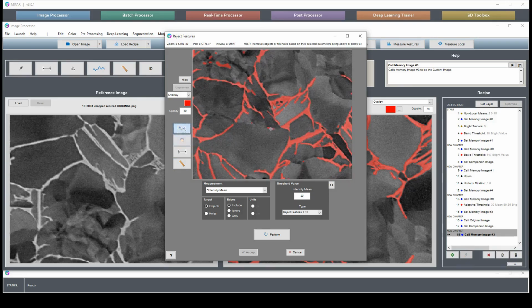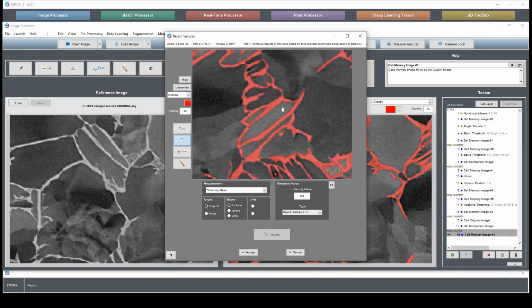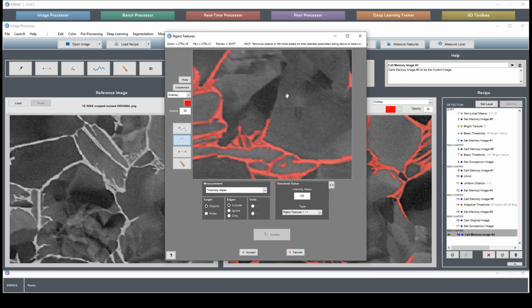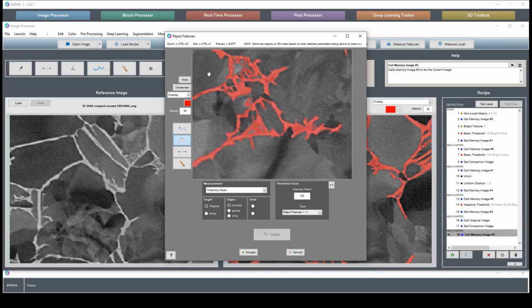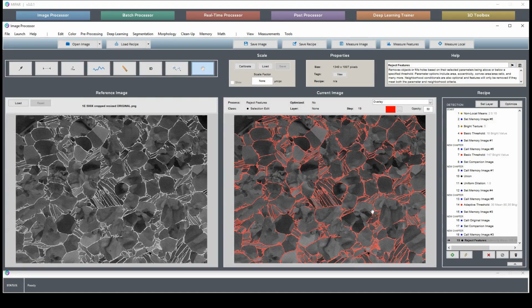How about we find some more isolated small pieces? 125, 93, so 125. So it appears that there's no hope for this dim feature here, but so be it. It can't be absolutely perfect. But looking at the segmentation overall, I'm actually pretty happy. Okay. So now we have our clean beta segmentation.